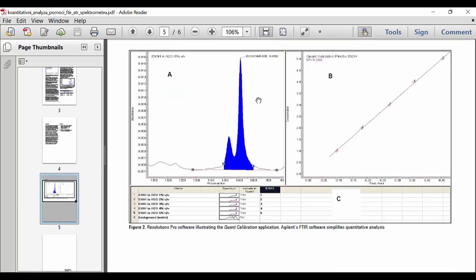Turns out that when one looks at the ethanol peaks or the CO stretch in ethanol, we can get Beer's Law style plots. In this case, they demonstrated between 1 and 5 percent alcohol content being rather precisely measured, and I want to see if we can use this for slightly higher concentrations such as in wine.